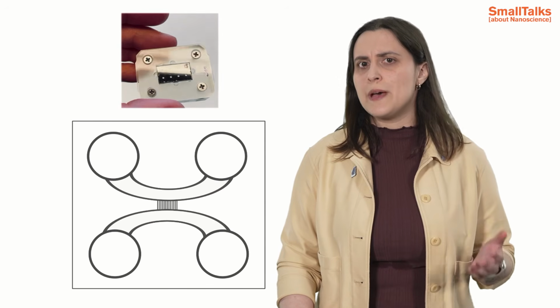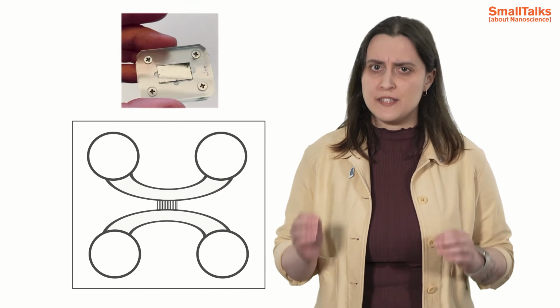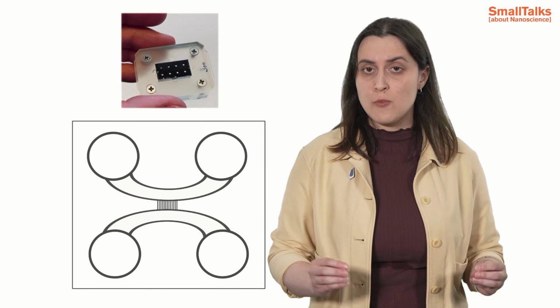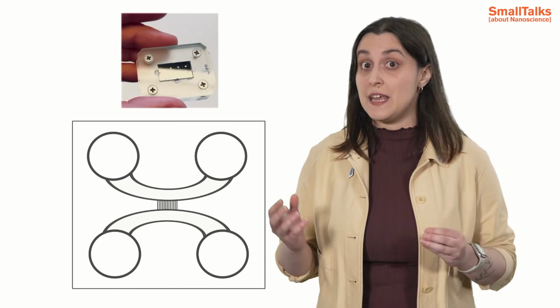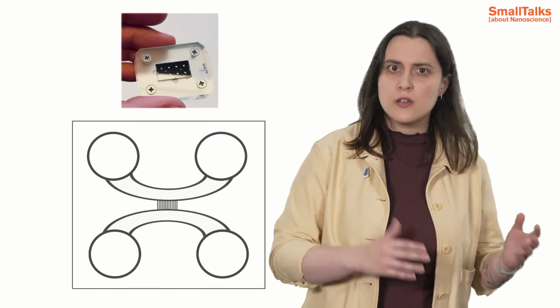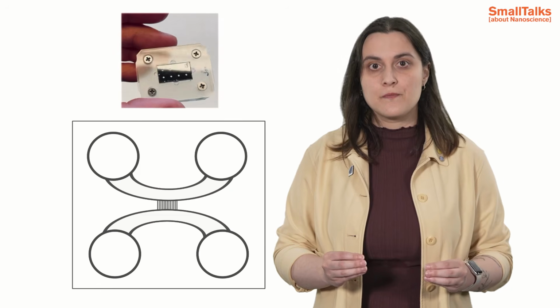Additionally, I would like to mention that if we use the same types of channels and the same conditions, we get a very uniform stretching. It means that the extensions of the DNA molecules on our images represent the real lengths of DNA molecules. And thus, we can compare different samples with or without protein, or with different concentrations of the protein between each other.